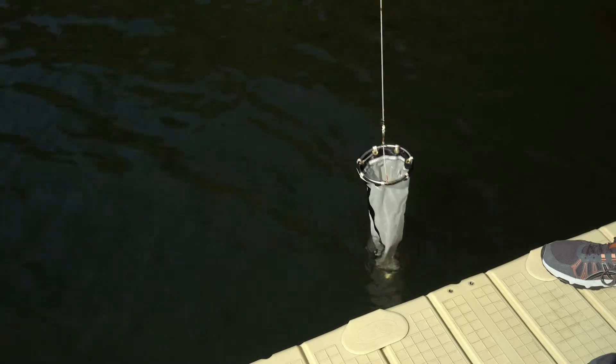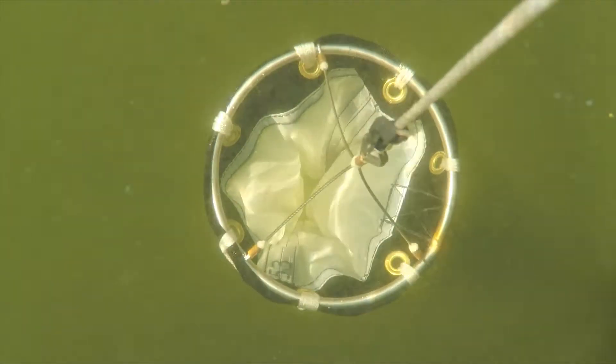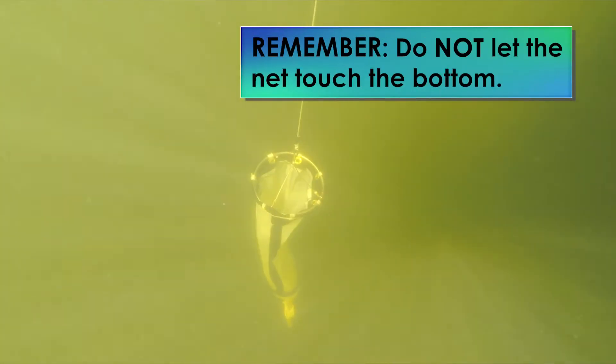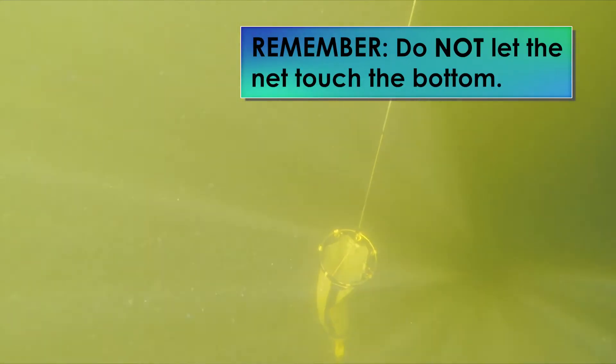Using the attached rope, lower the plankton net to your desired depth. The rope is marked so you can track how many meters deep you are collecting from. Just make sure the net does not make contact with the bottom when you are collecting a sample.